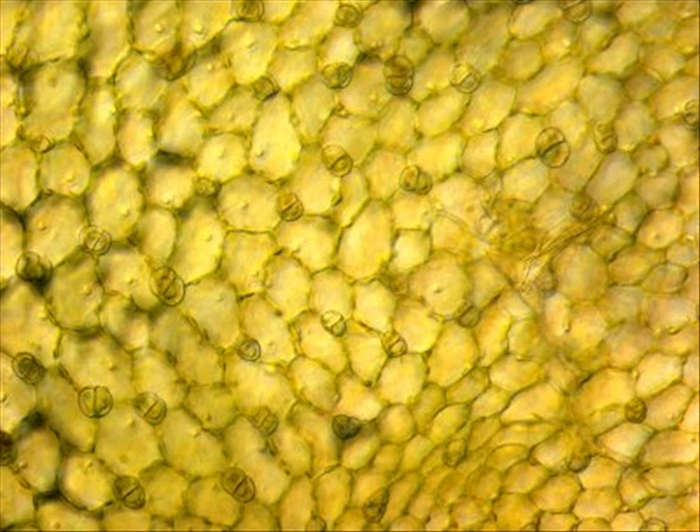Here we have the stomata on low power — they appear closed. If you look closely at the edges of the bigger circles, you'll see smaller circles. Try to see what the middle of them looks like. Make a nice detailed sketch for low power, which is 100x.